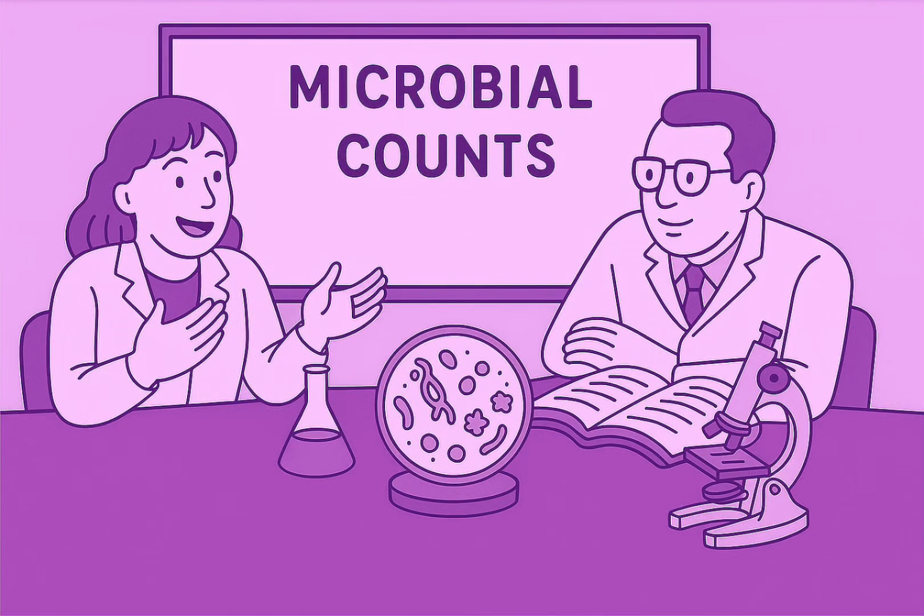Okay, so let's dive in. We've got this great stack of sources here sent in by you, our listener, all about something really fundamental, but wow, also kind of complex. How do we actually measure the number of microbes in something? You know, bacteria, yeasts, fungi, the tiny stuff.